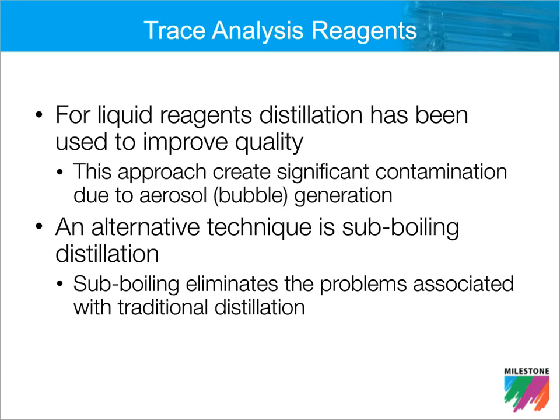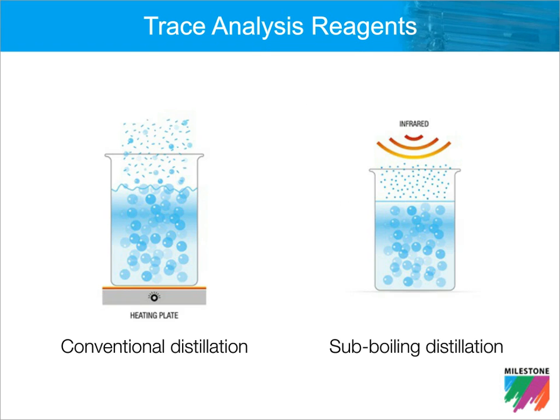Now, liquid reagents: traditional distillation is the way that reagents are purified. The challenge with this is that we're basically boiling the reagent, and this boiling creates aerosols, and your contamination can travel with the aerosols. An alternative technique, or a better approach, is actually sub-boiling your reagents, and that eliminates this creation of aerosols and gives you much purer acid.